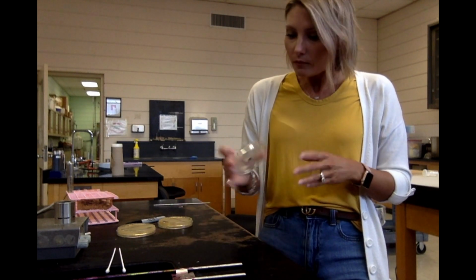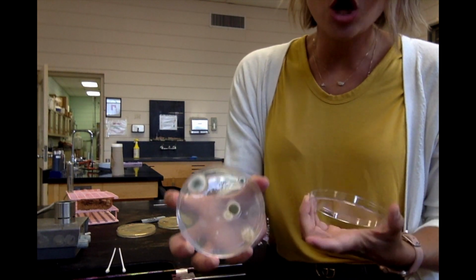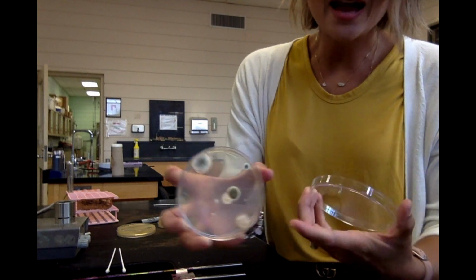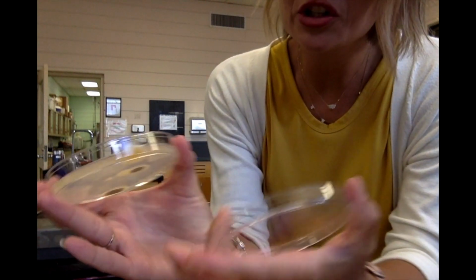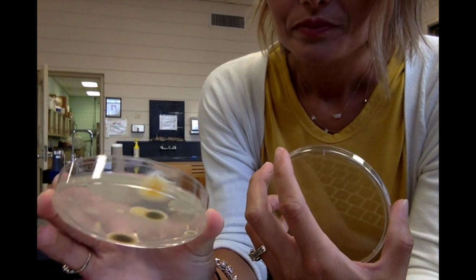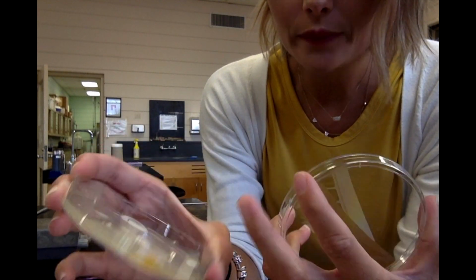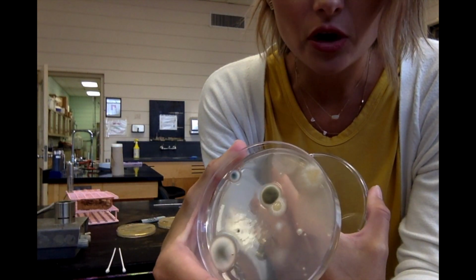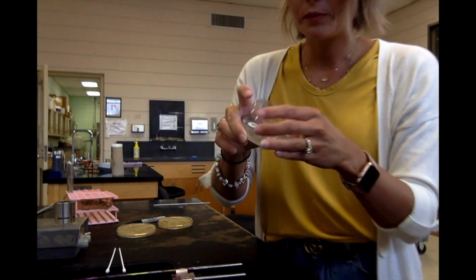So fungal colonies come in all kinds of shapes and sizes and colors. Sometimes you'll see black. These are kind of a green color. You'll see that there's an orangish looking one. Okay, the inner is orange. So lots of cool colors. They form these indentions into the media, so they grow into the media. So these are going to be your fungal colonies on PDA.